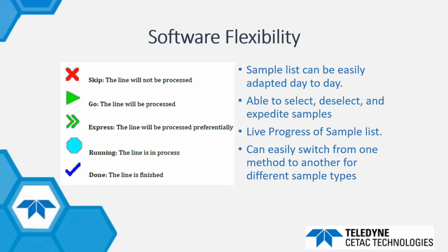But you can use that same file even if on a given day you only have like 23 samples, or at the end of your day you have an odd batch that doesn't fit nicely into 60. You can very easily adjust the existing file to go from doing 60 samples down to the desired 23.